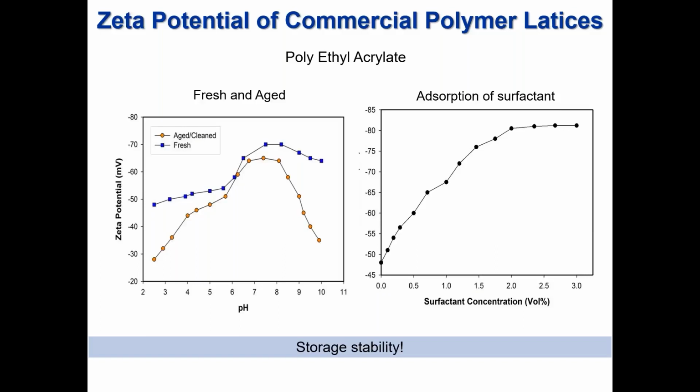At this neutral pH, roundabout here, there's very little difference in the zeta potential, but at acid or basic media, there are large differences. So if you were only to make a single measurement at around pH 6, you would conclude, erroneously, that both these materials were the same. So the surface chemistry of the latex, and hence its performance, is very much dependent again upon the history of its production and storage. And this again can be monitored using zeta potential.